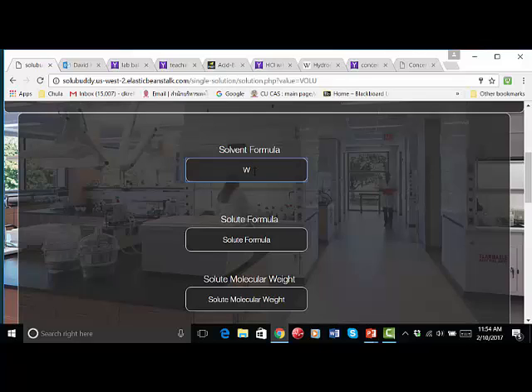We never use their molecular weights to calculate concentrations of solutes, for example. We just refer to the solvents by name. So solvent formula can be changed to solvent name. And if somewhere in the program it takes that formula for the solvent and calculates the molecular weight, that's absolutely unnecessary. It's a waste of code.